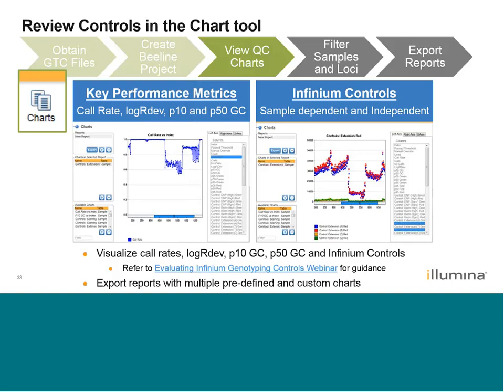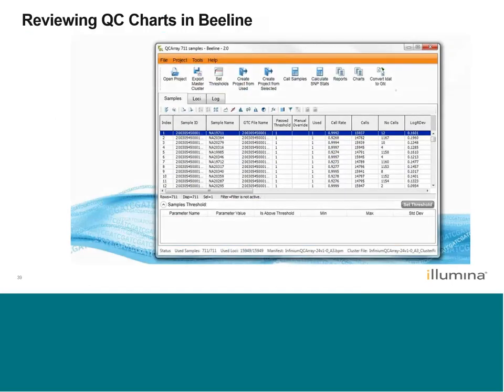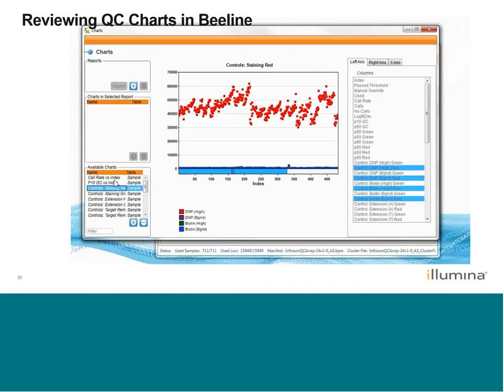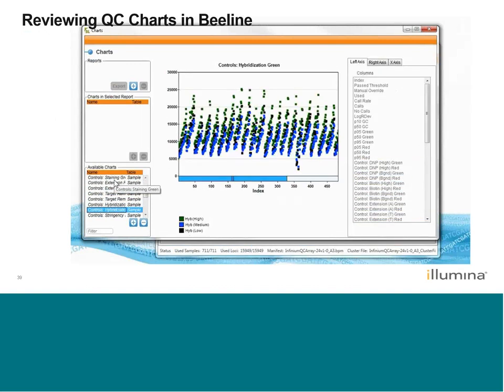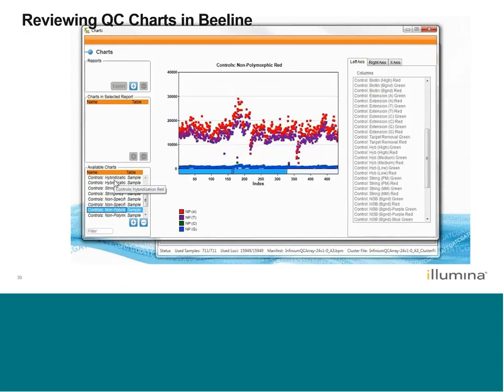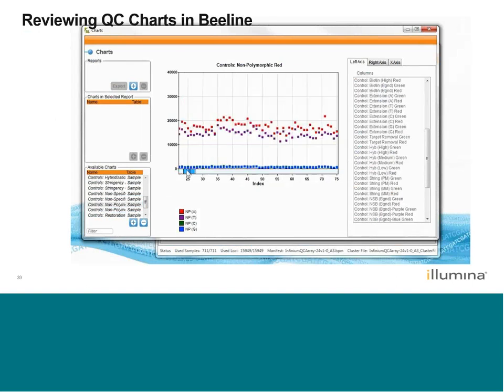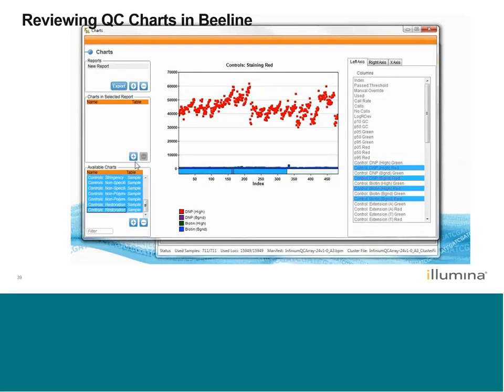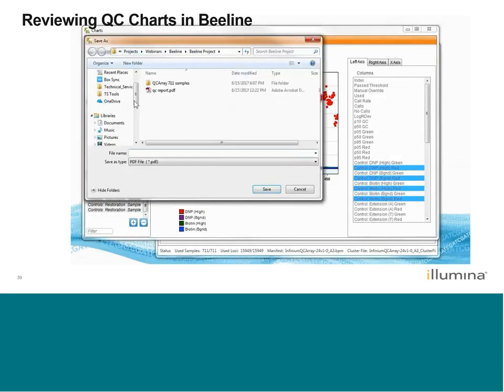You can also export a PDF report containing however many charts you want to include. In the demo: in my Beeline project I go to Charts — the available charts come pre-formatted with every install of Beeline, but you can add other charts you'd like to see. All the controls typically seen in the Genome Studio controls dashboard are also shown here. You have the option to scroll left and right or use the scroll wheel to zoom in on controls to look closer at certain samples. You can select the charts you want, add them to a report, and export it to a PDF to share with a collaborator or keep in your records.